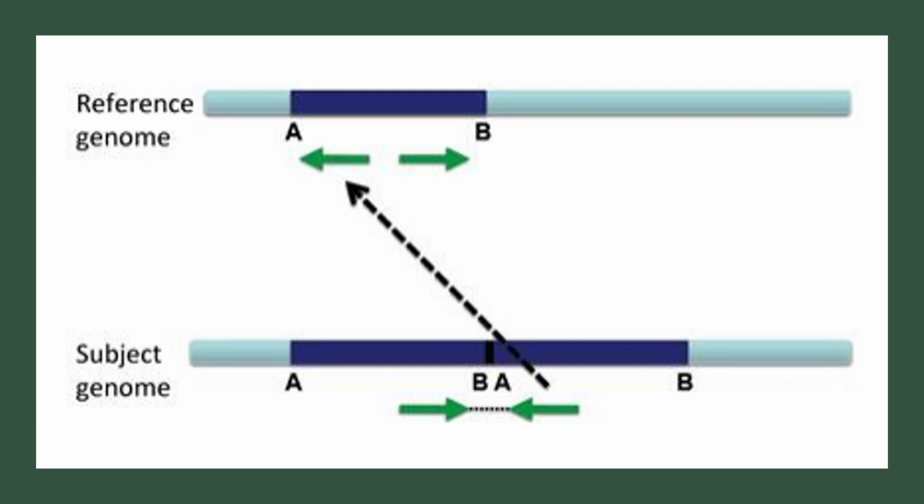So now let's suppose the subject has an internal tandem duplication, or ITD, that is so large it cannot be spanned by a single read. The duplication is not going to show up in IGV clearly because IGV is going to collapse it as best it can to align it against the reference genome that does not have a duplication. So again, we will have to use clues to detect an ITD.